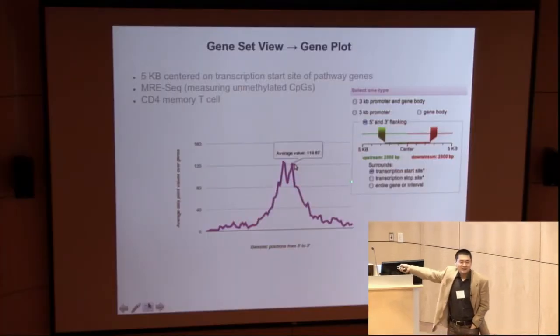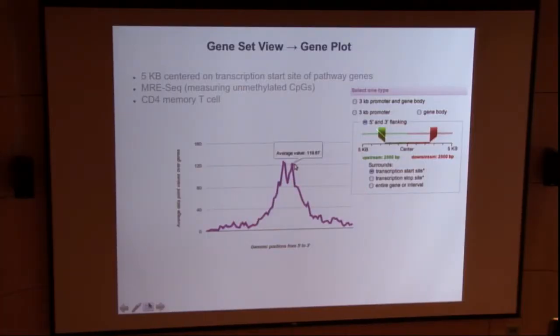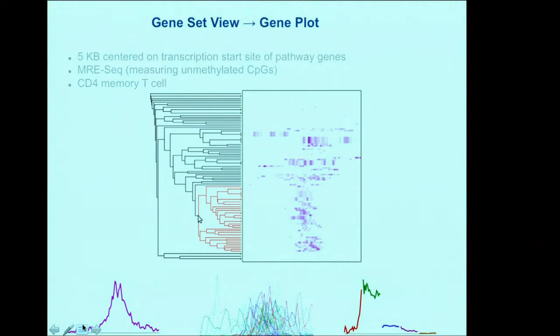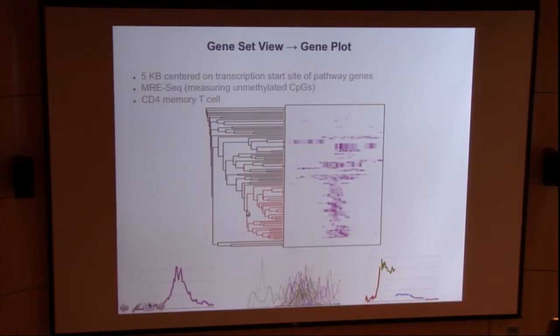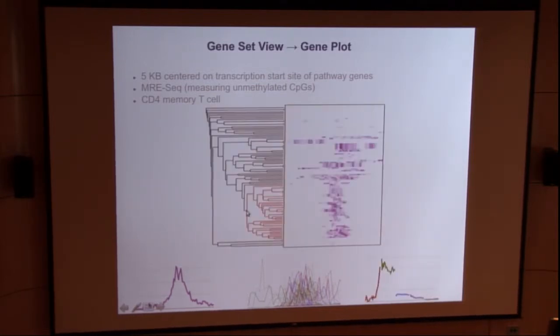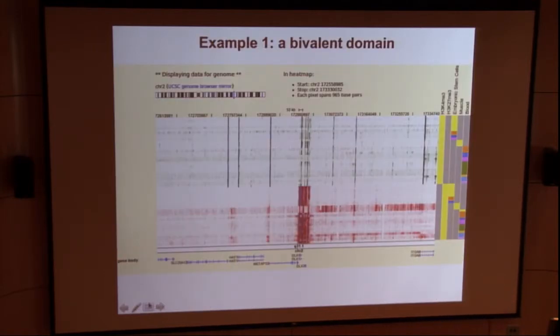The point is you can get a peak, right? This is a peak for unmethylated transcription start sites. So you can do this with just moving things around on the browser. Okay, I'm going to quickly skip this. You can do different types of profiling. You can do clusterings by just, again, a few browser hits, right? So this again shows the unmethylated pattern of the transcription start site. Okay, I have a few examples, but I'm going to skip them.